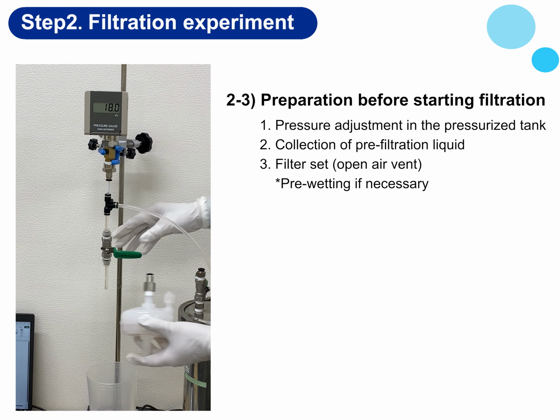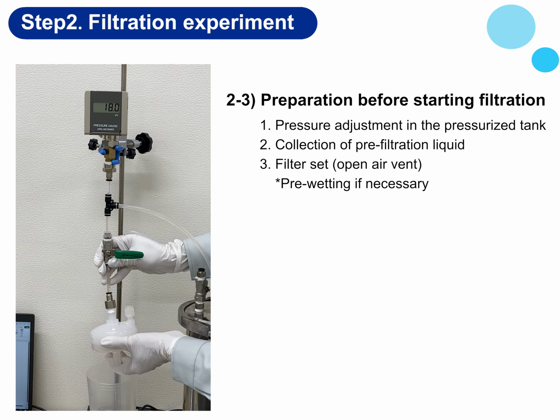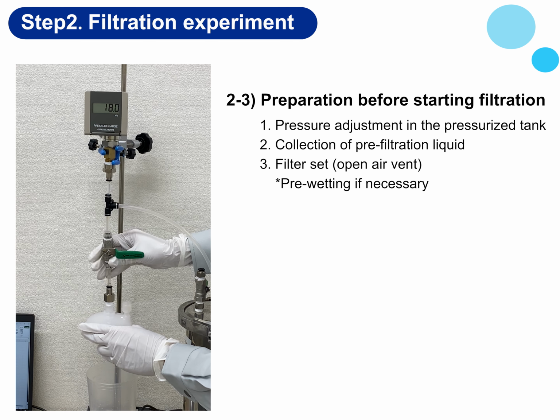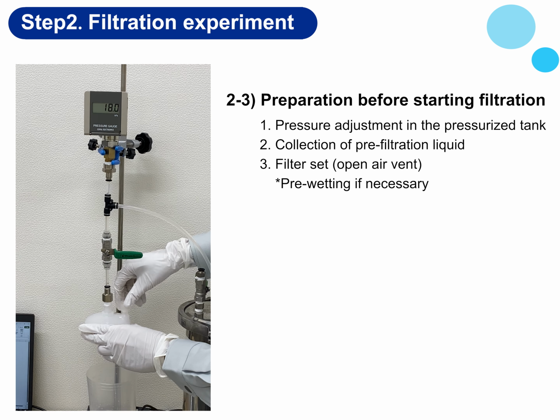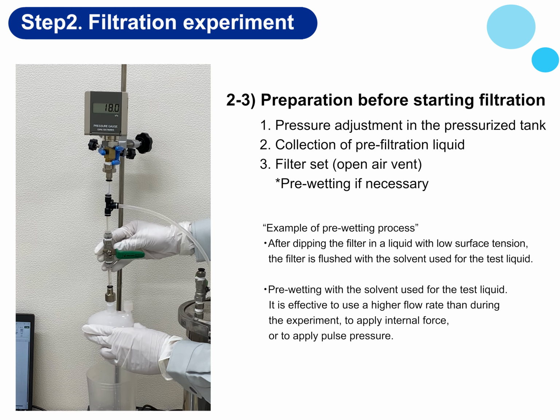Next, set the test filter. If the filter has an air vent, release it. Depending on the compatibility of the liquid and filter material, the test filter may have difficulty wetting the liquid with a fine filtration precision filter. In some cases, if the filter is not sufficiently wetted, the entire filter media is not used, and the original filter performance cannot be utilized. In this case, we recommend pre-wetting the filter before experimenting.